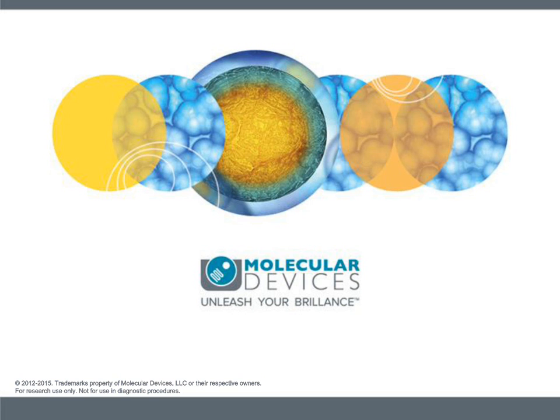Yeah, it can definitely do that. So there's a number of ways. Detecting the cells, it can do through any of the 3 channels. It can do it through the transmitted light channel using the StainFree analysis. And there, as I had mentioned in the presentation, for things like CHO cells where there's a common morphology, we have a lot of predefined settings that can be applied, and those are available for several different common cell types, including some fibroblasts and some suspension cells.